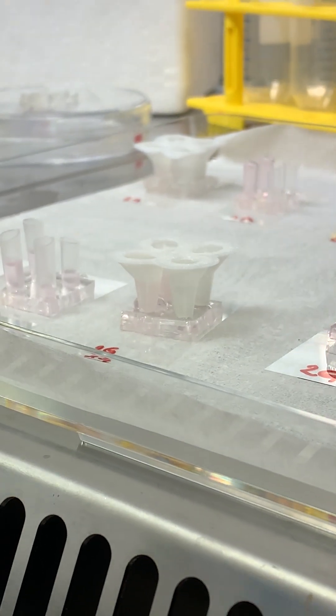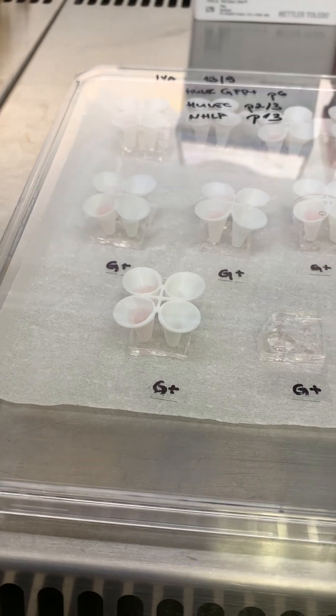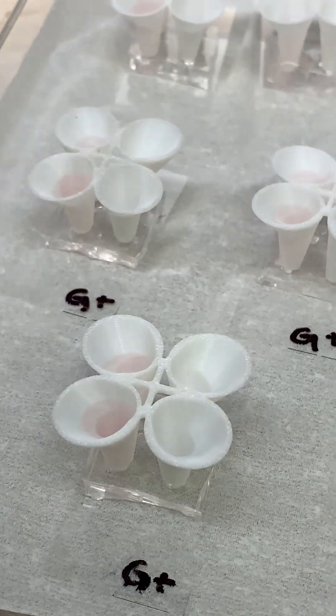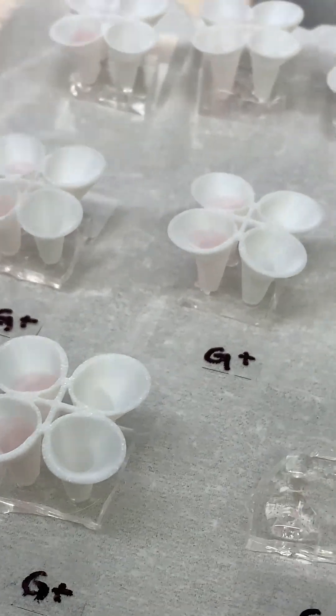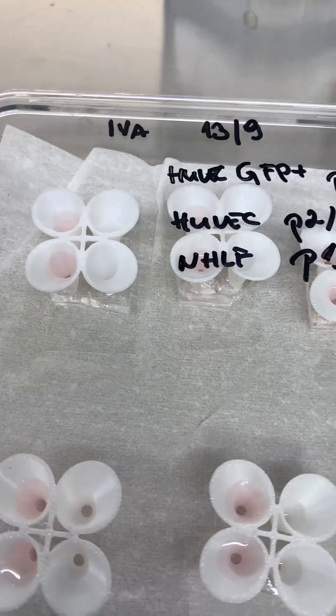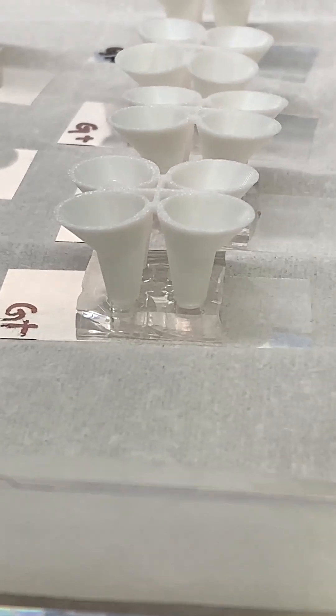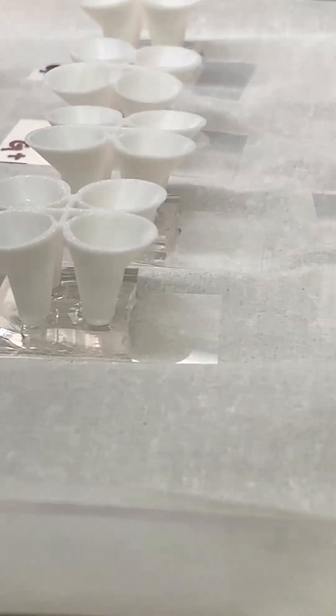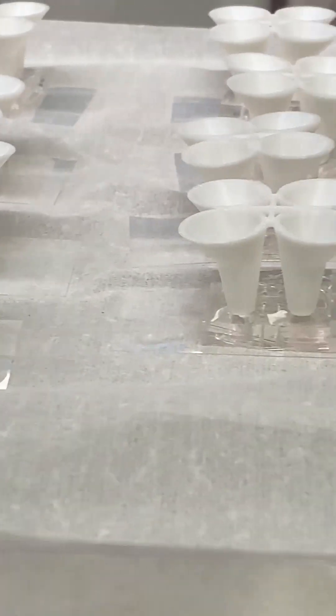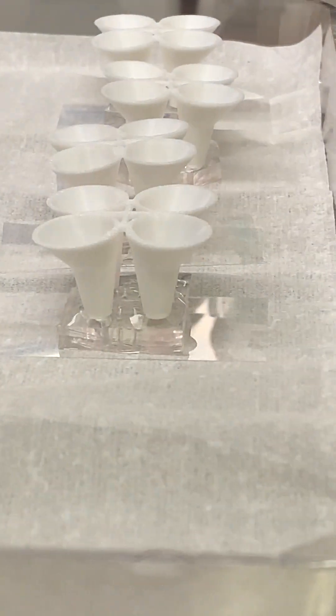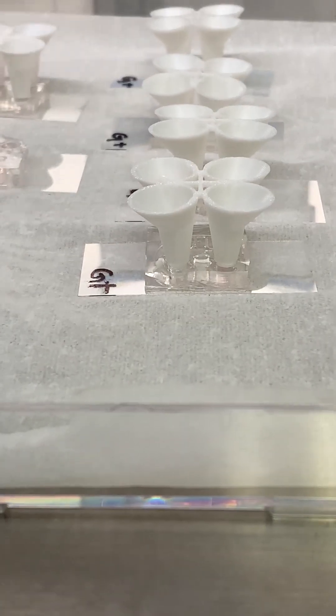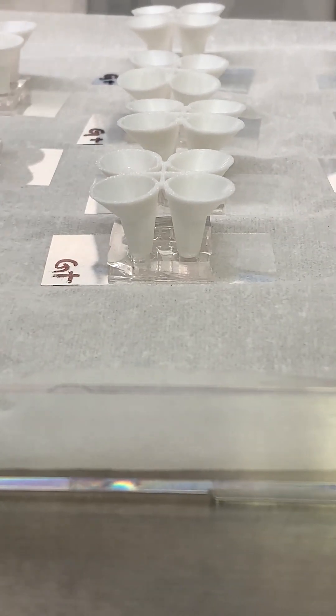The cones are then filled with growth media while the remaining inlets are used to introduce the cells. At the moment I'm still perfecting the process, especially when it comes to post-processing the template for the chip.